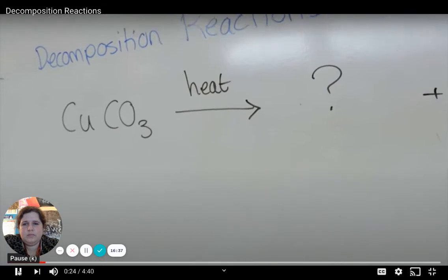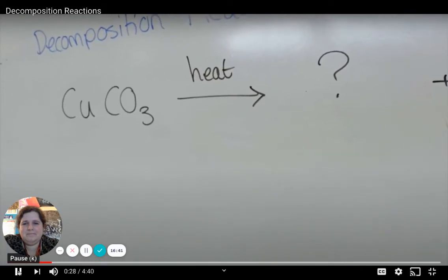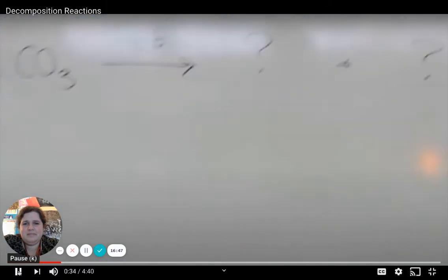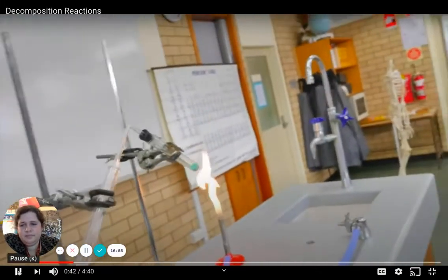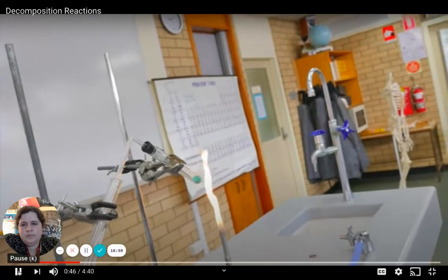You can't break it down into itself. What is it going to break down into? Carbon dioxide, volcanoes. All right, we've got a variety of answers. Let's see what they have. Now, some people said carbon dioxide, and I think that maybe they're right. How can we tell if we're creating carbon dioxide? It's colorless. All right, that's difficult to tell. We can see bubbles, maybe.